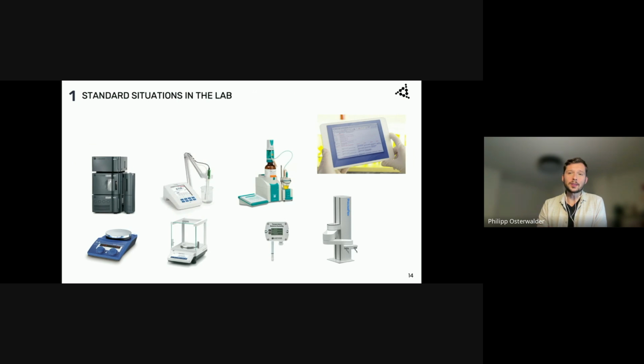It always makes sense, as an example, for a high sample throughput laboratory, which has thousands of samples per day, and where there should also be a workflow automation implemented, that there is an integration to this device system.